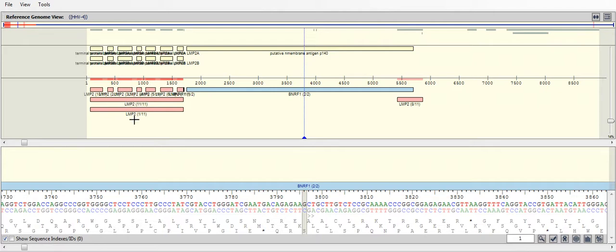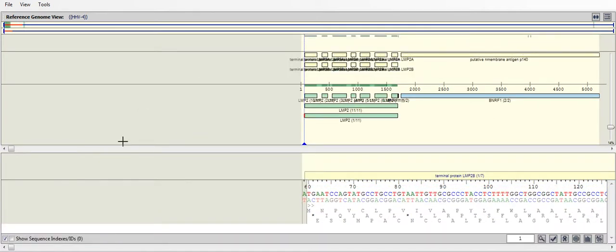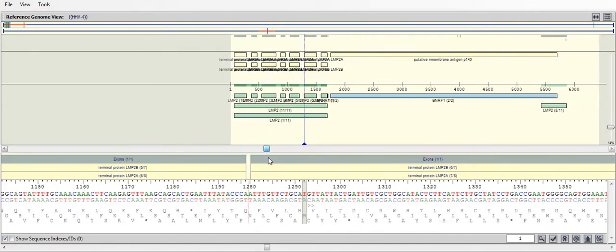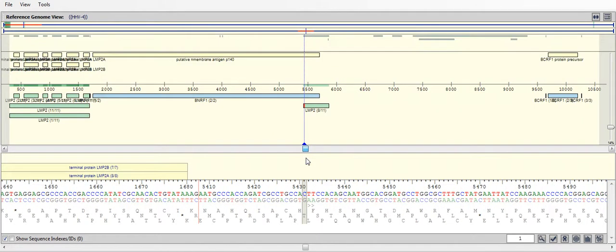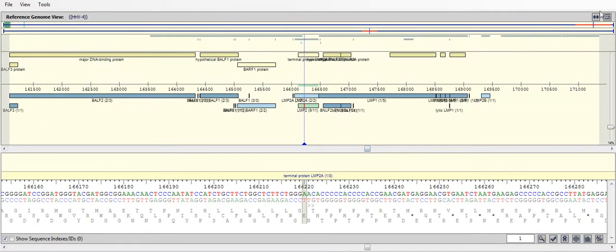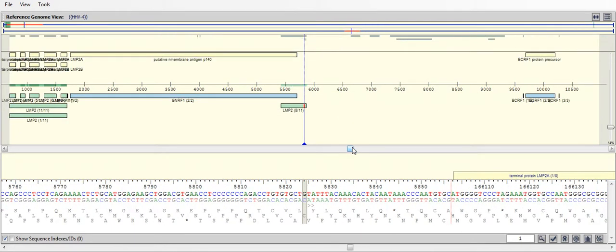This feature has 11 splices spread over the full genome. The splices are separated on the reference sequence by a red dotted line.